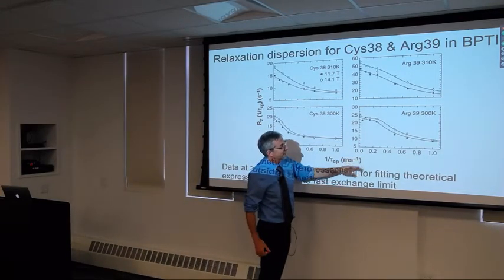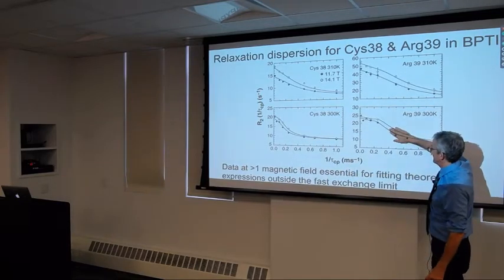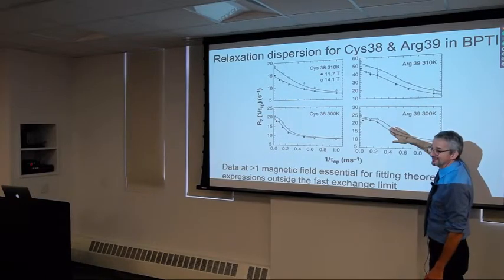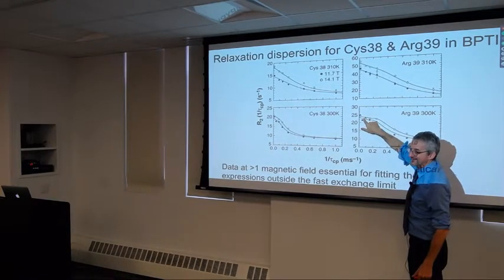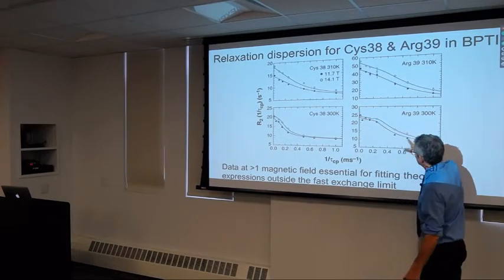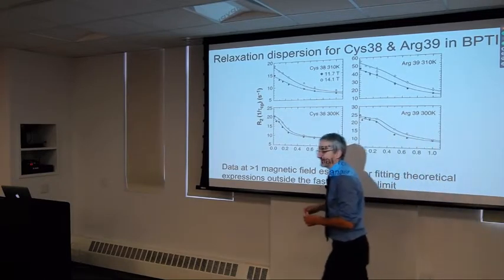But I don't know, for example, we've never tried, that if you left these points out, what would happen to the fit? I don't know. I mean, it's quite clear we need at least a couple of points in here to know that these curves don't keep going up. But how much information there is here, whether you really need those or not, I don't know. We've never tested.